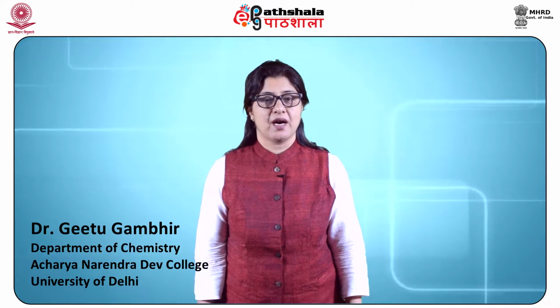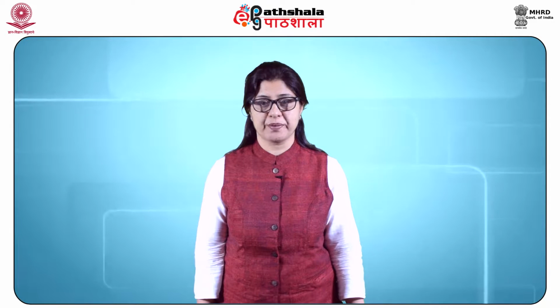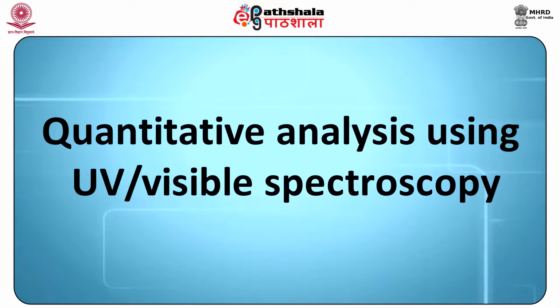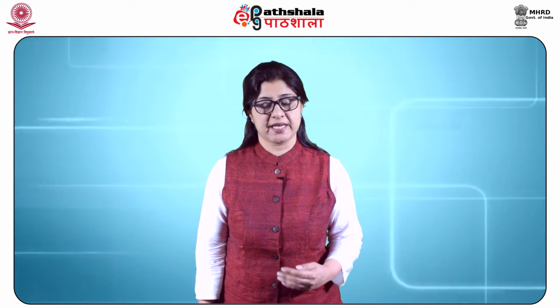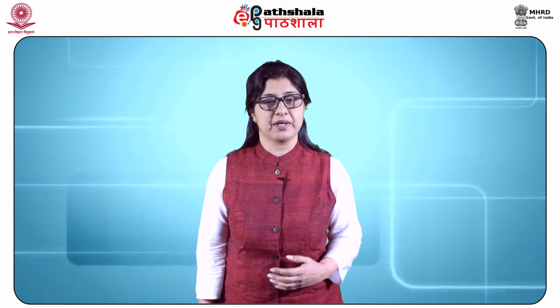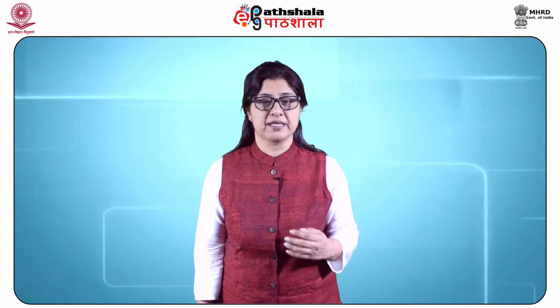Dear students, after studying this module, you shall be able to understand the usefulness of UV visible spectroscopy for quantitative and qualitative analysis. Initially, quantitative analysis using UV visible spectroscopy. The determination of concentration of a sample under study, or analyte, is one of the major applications of UV visible spectroscopy. Quantitative analysis involves the determination of exact concentration of analyte under study.